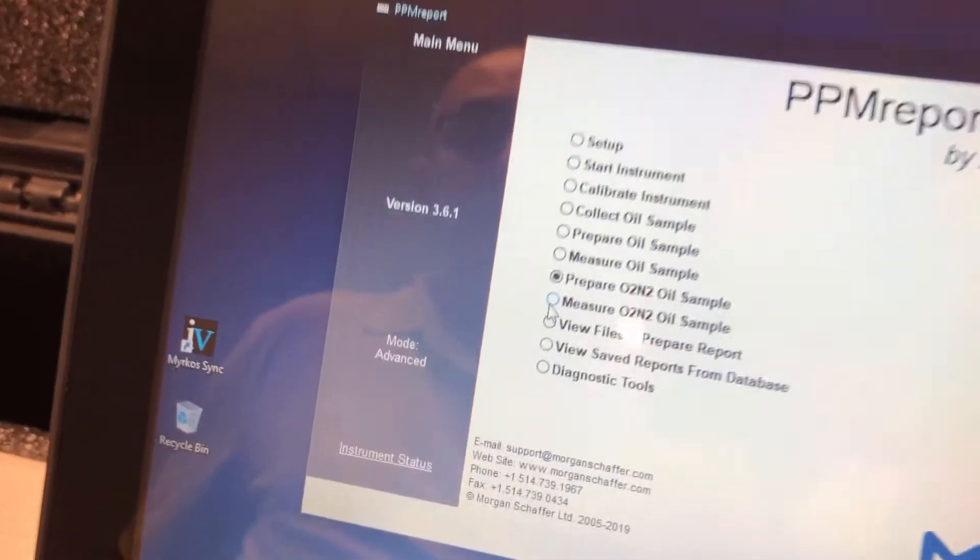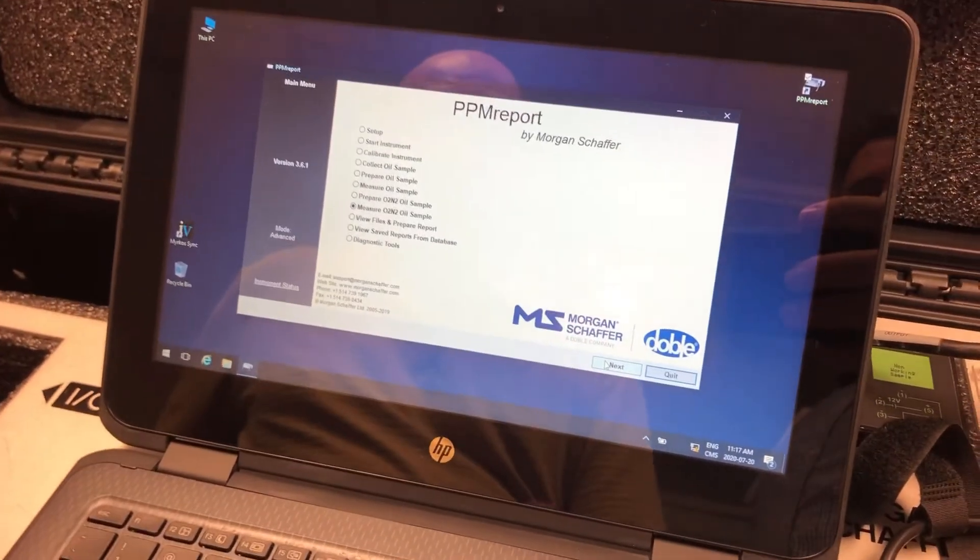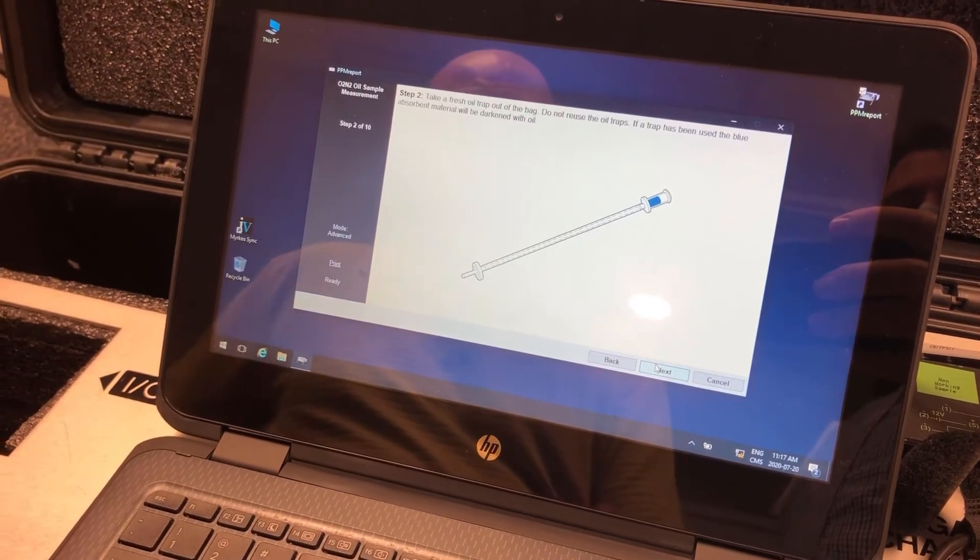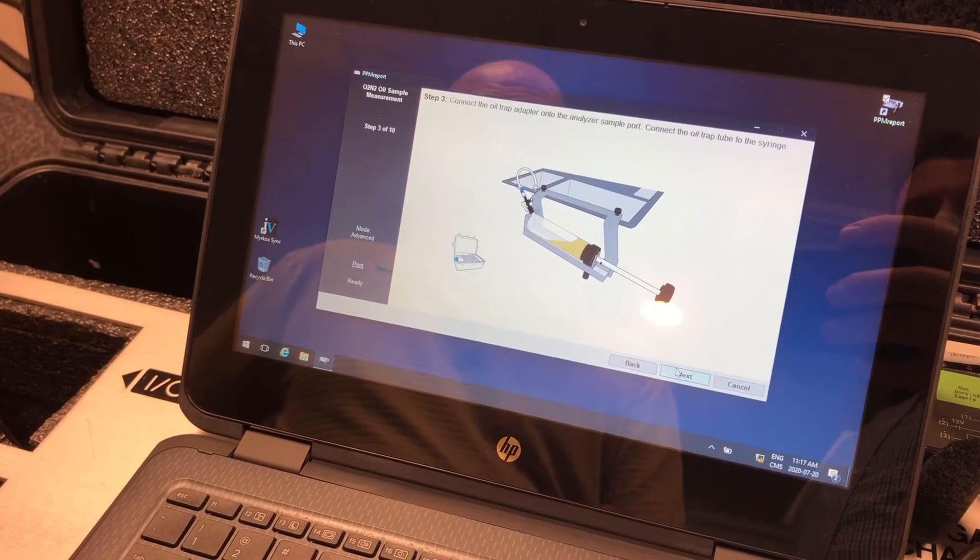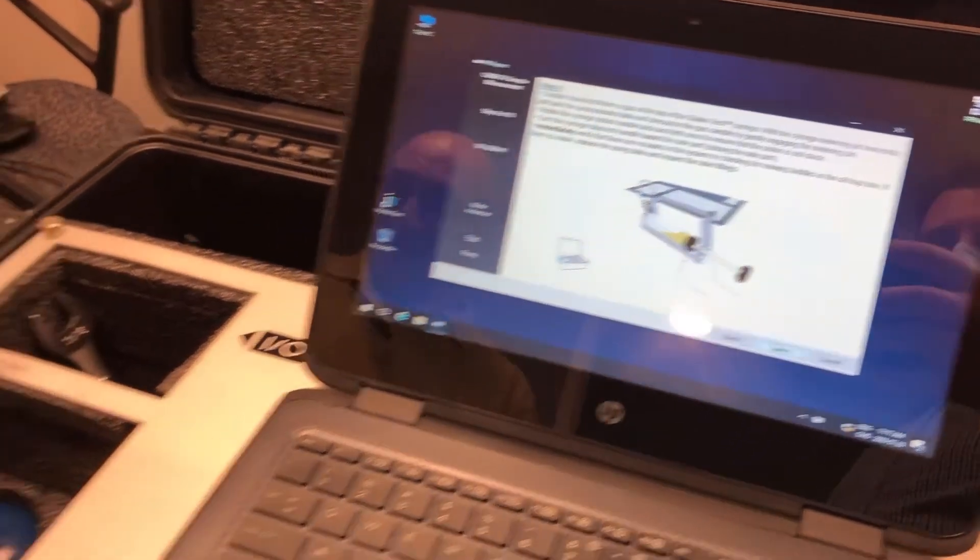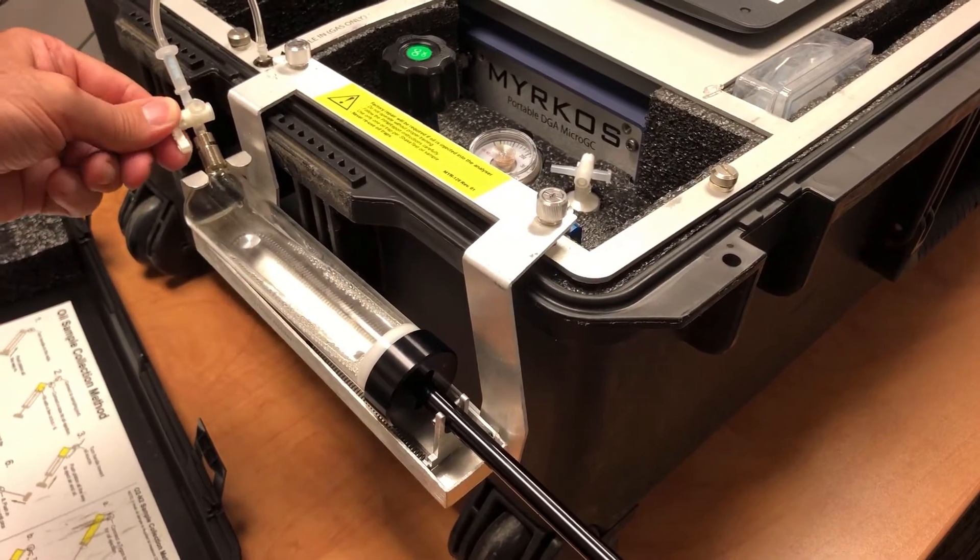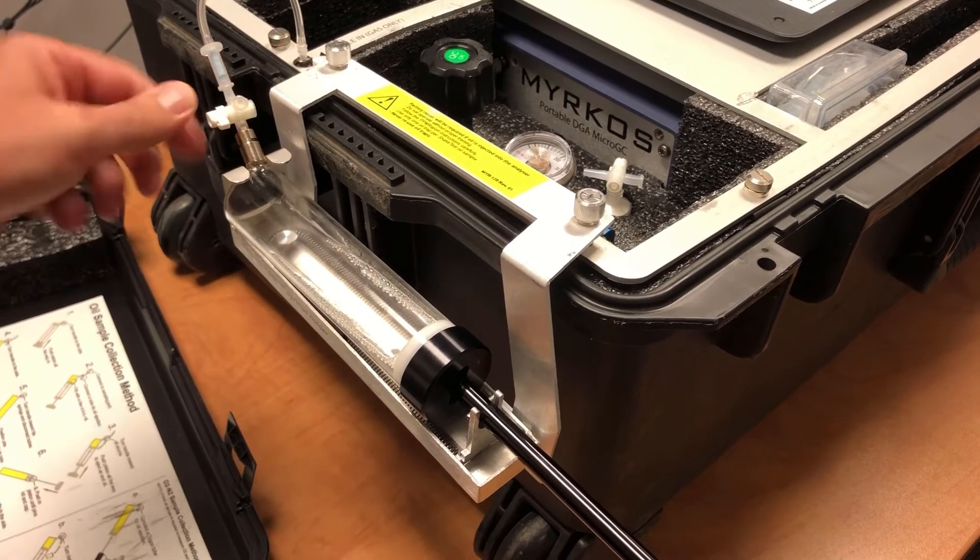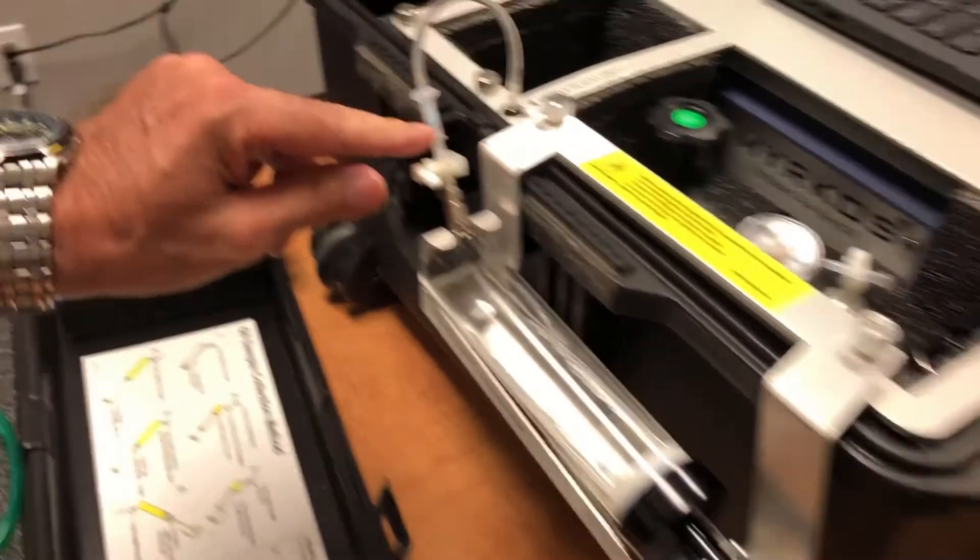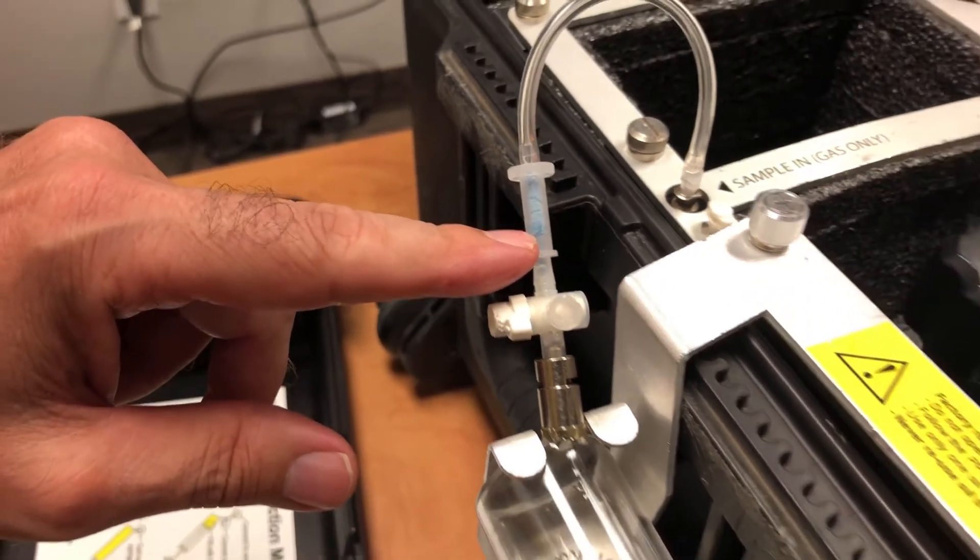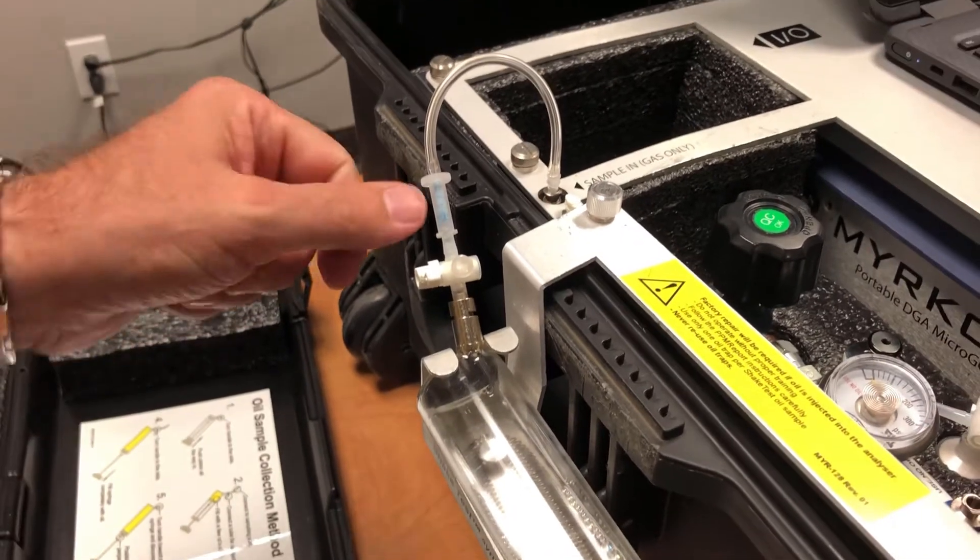So now, we are at the measure of the oxygen-nitrogen. So again, you click next. Use a brand new oil trap. Same thing than before. You put the syringe under pressure. You open slowly the valve to make sure that you see some oil being picked up here by the oil trap. Let's stop it.